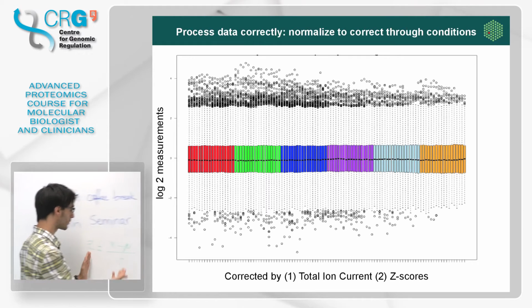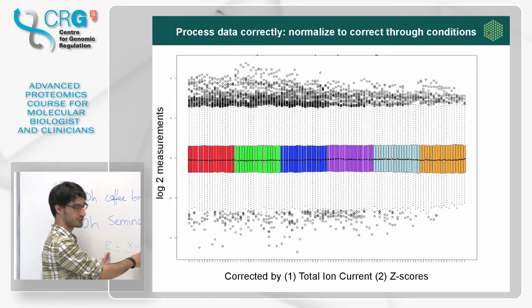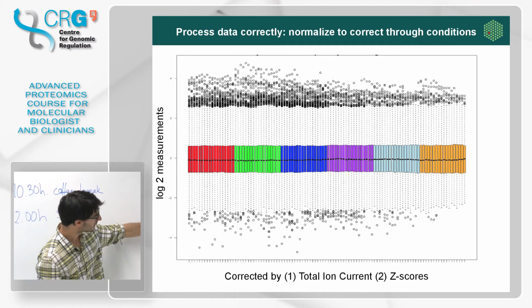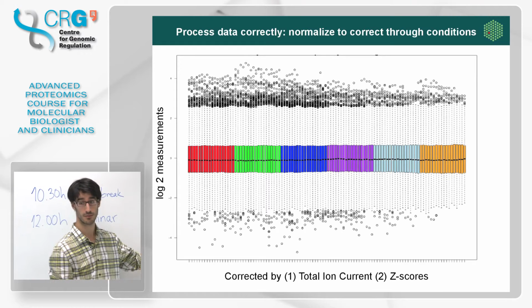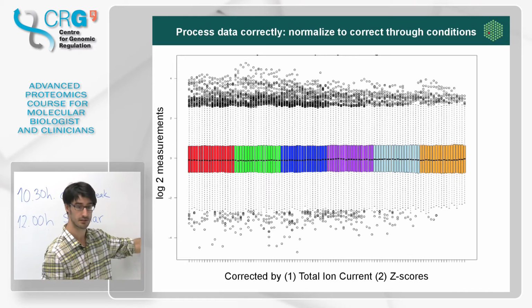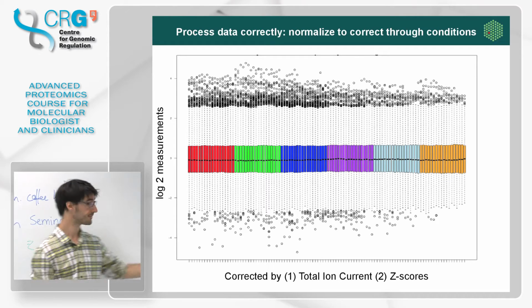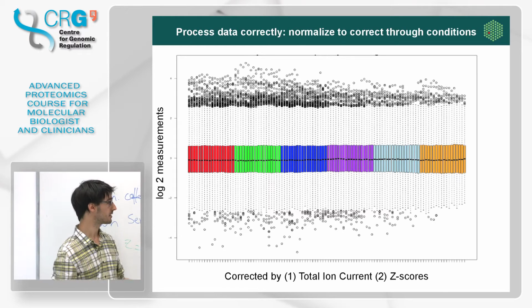I just told you that we made all of them comparable in that they all are centered around 0. So if they are all centered around 0, how come that here this line is not always at 0? And the answer is that in box plots you don't use the mean, you use the median. So what we see here really is the median. That's why it's a little bit different. But still, it's good to see that the median is similar for all of them, you see? Good. So the first quantile, the second quantile is the median, third quantile.